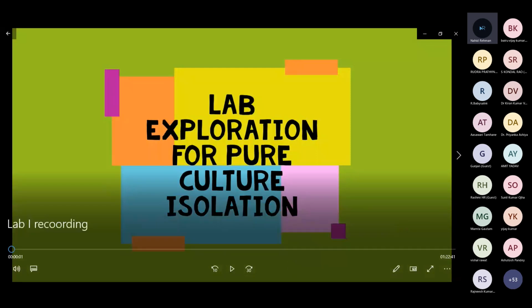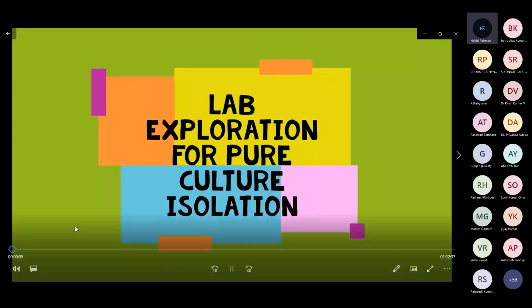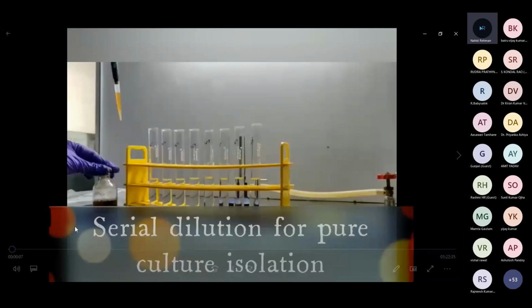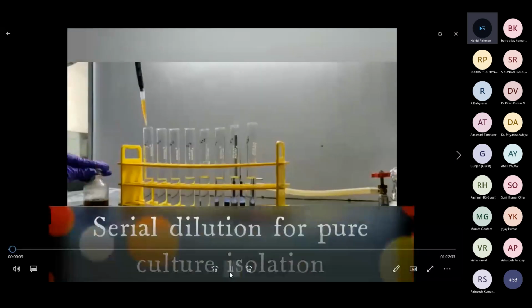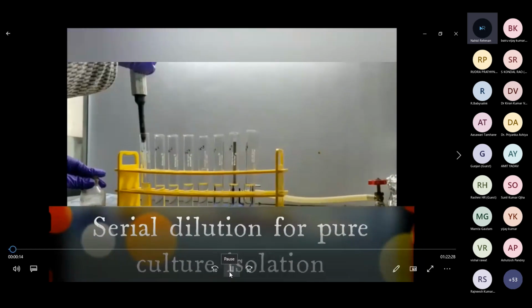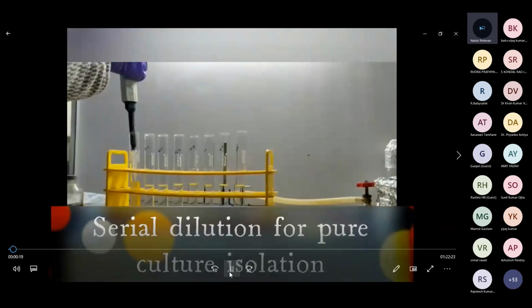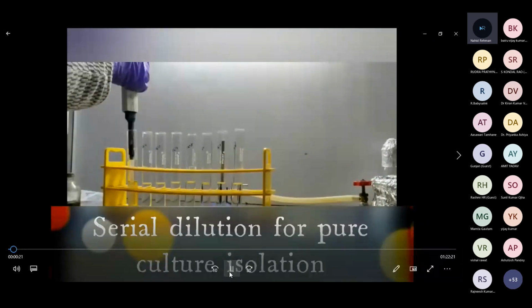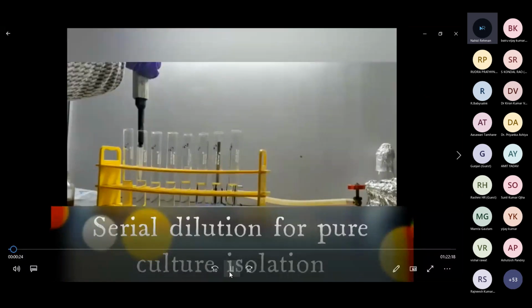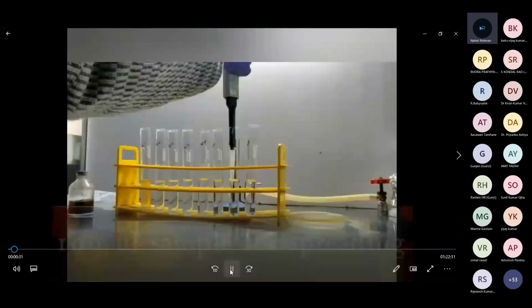So I would now share this video. It has been prepared by my research scholars. They did a good amount of work to show you how to purify these microbes from the industrial waste or effluent. It is one of the very popular methods of purifying microbes, and this is called the serial dilution technique.